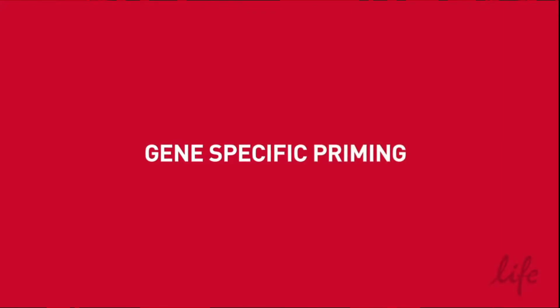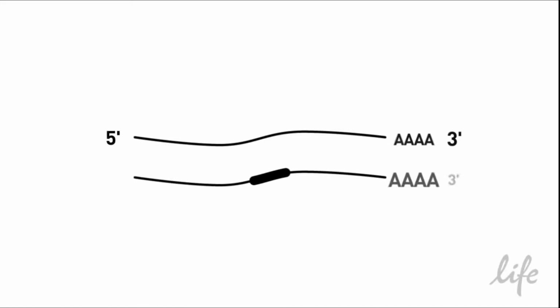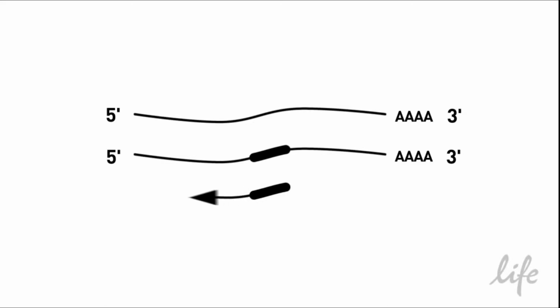The final option for primer choice is gene-specific primers. These will only make cDNA for the one specific target. Gene-specific primers are required for one-step real-time RT-PCR reactions. The cDNA yield will be lower with the gene-specific primers since you are only targeting one transcript.